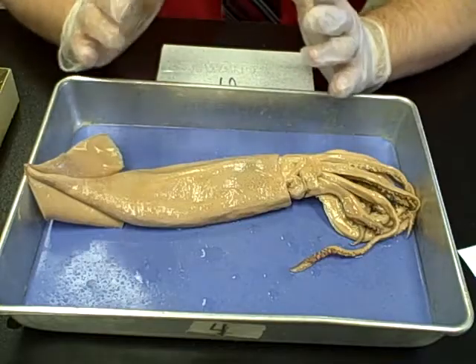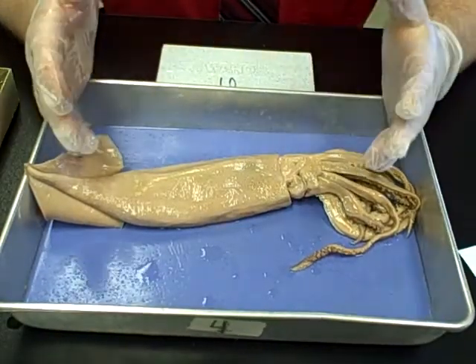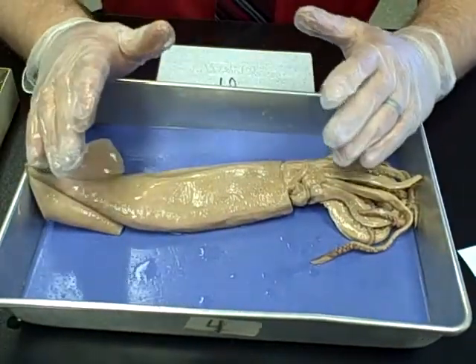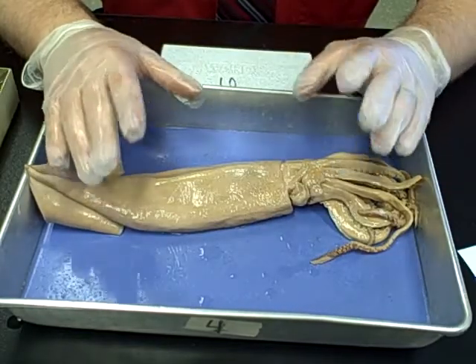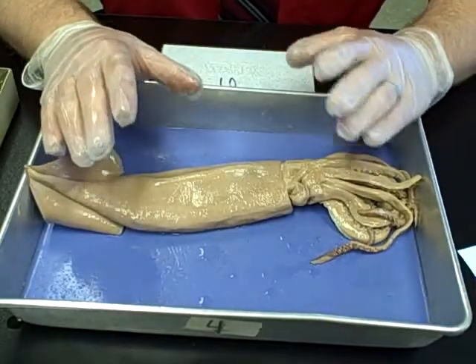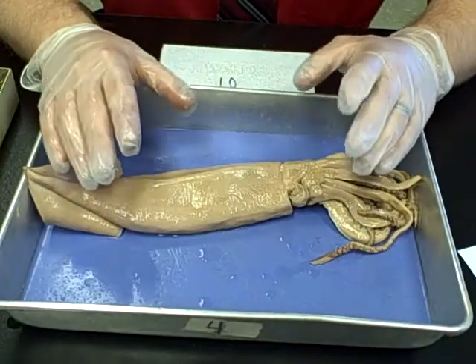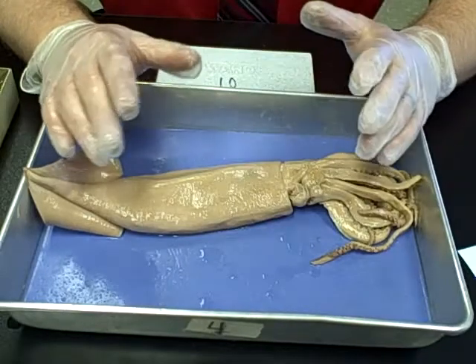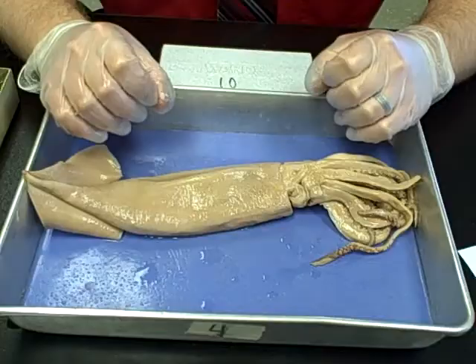Welcome to the squid dissection. The very first step is rinsing the squid off — they're stored in preservative fluid that needs to be rinsed off before we can safely dissect. Take them over to the sink and rinse them off very carefully. This is why you have to wear safety glasses during dissections, because that's when you're most likely to get something sprayed in your eye.